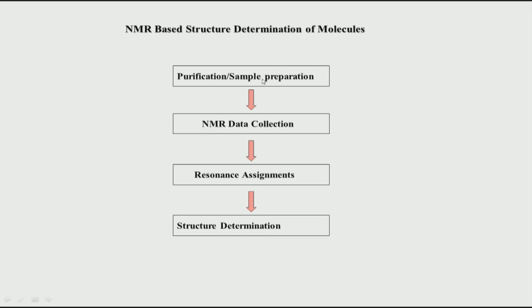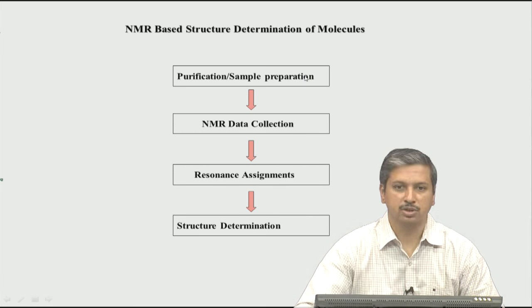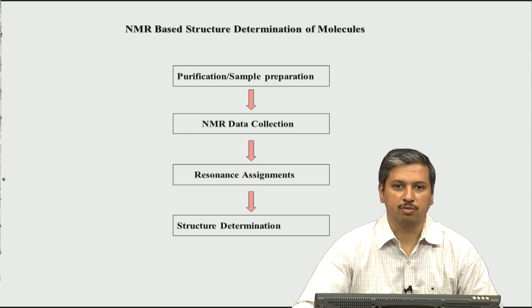The reason for this is that the impurities present in your sample will have extra peaks or correlations in your 1D and 2D NMR, and that can lead to ambiguity or doubts in solving the structure. So, if it is more than 95% pure, it is very unlikely that the small impurities will give any strong correlations in the spectrum.